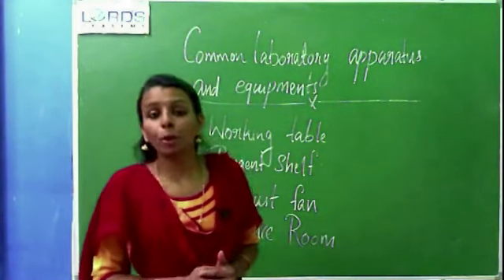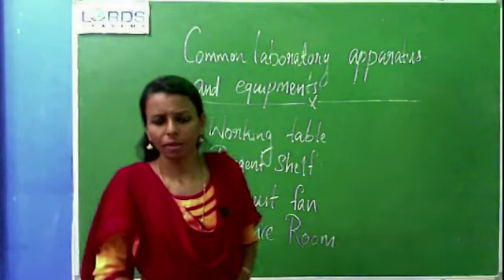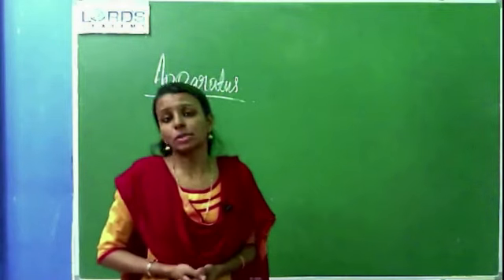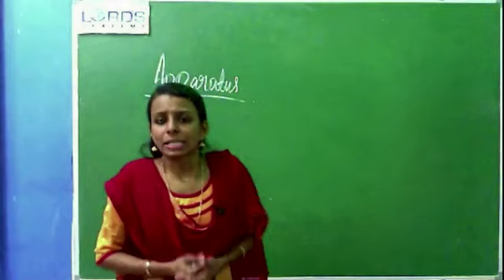Topic: the important apparatus we are using in the chemical laboratory. What are the important apparatus we are using in the chemical laboratory? There are a number of apparatus we are using for doing different types of experiments. We will discuss them one by one here.